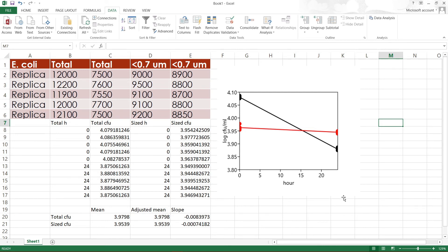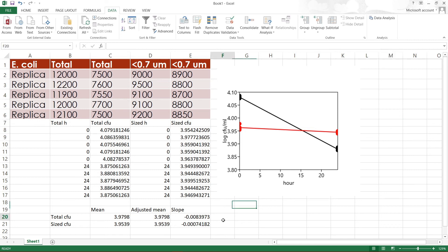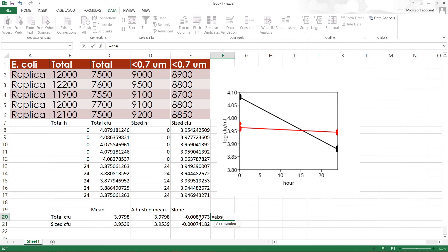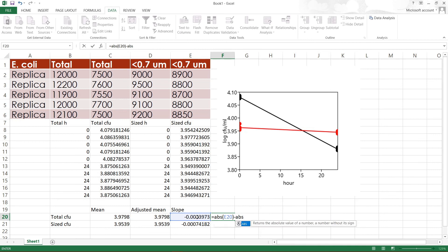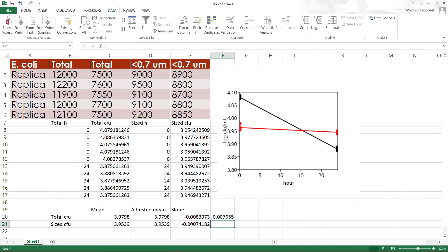There are certain things that you cannot do. So from here you have your slopes for the total seawater and also for the size-fractionated seawater. You know the main difference between total seawater and size-fractionated seawater is the presence of grazers in the total seawater. So what we do is find the difference: the absolute value of one minus the absolute value of the other gives you the grazing rate of E. coli.